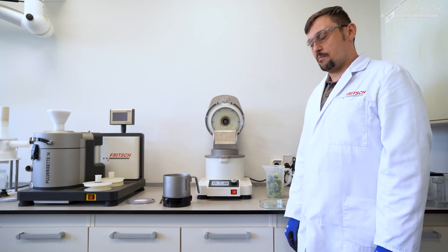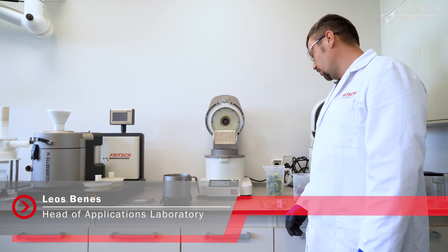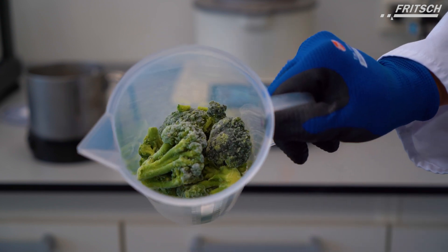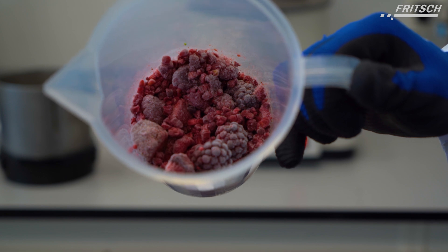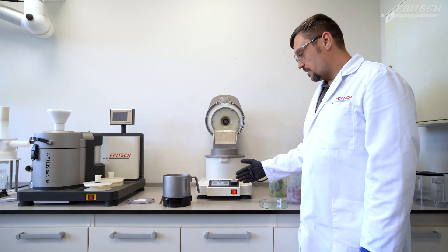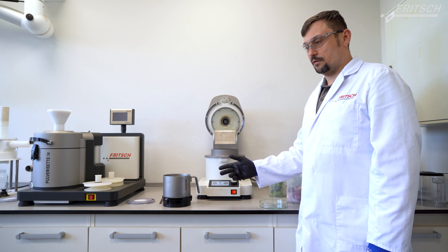This is a short video about the application of grinding with liquid nitrogen of fruits and vegetables like broccoli, and frozen fruits with P11 and liquid nitrogen using a cryo milling set.